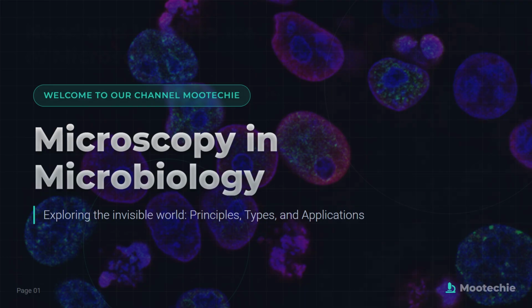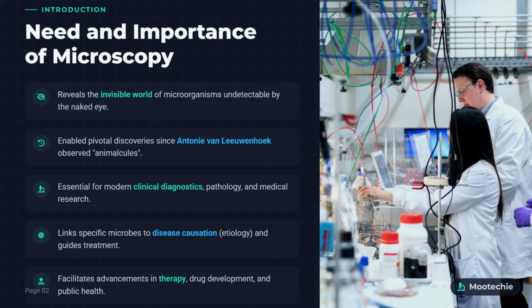Now, let's discuss why microscopy is so crucial. This introduction covers the fundamental need and importance of these instruments. Microscopy reveals the invisible world of microorganisms undetectable by the naked eye. Just imagine, entire universes of life exist completely hidden from our direct sight. It enabled pivotal discoveries ever since Antony van Leeuwenhoek first observed animalcules with his handmade lenses, sparking a scientific revolution.